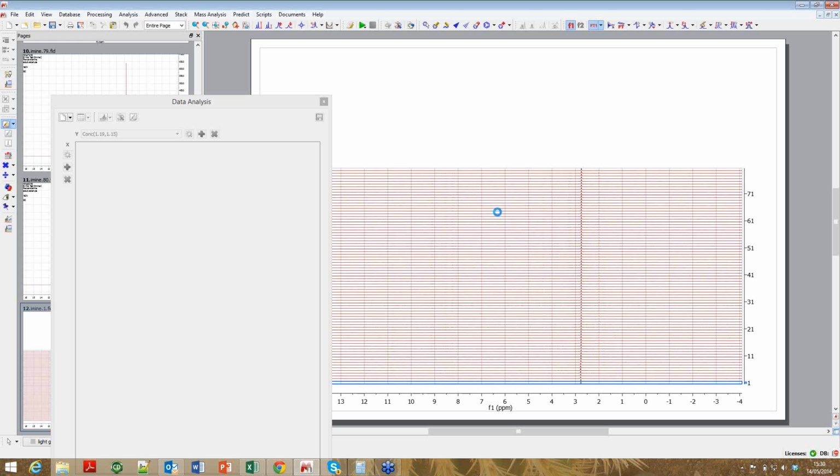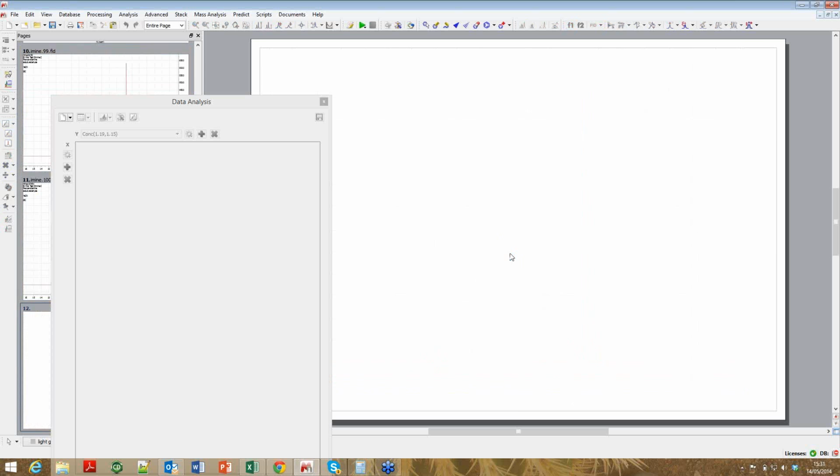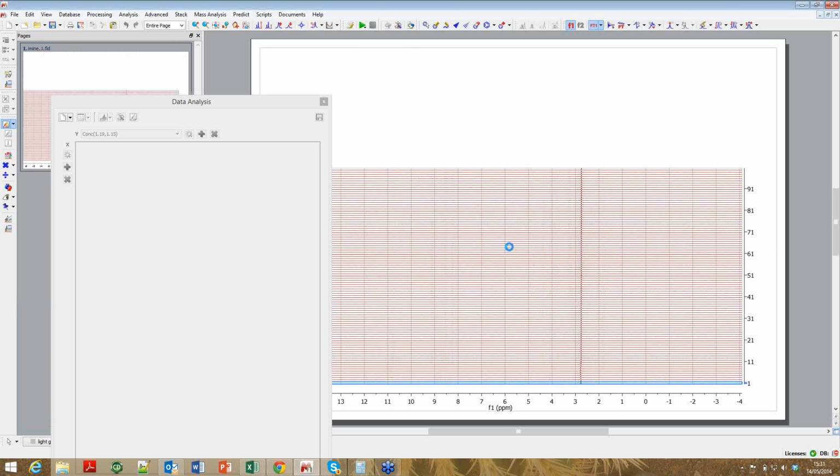Just to make a point: when you're doing these reactions on organic matrices or organic type reactions, and you do have the luxury of time, it's not uncommon to collect large data sets, perhaps with a couple of hundred elements to them. So this one with about 100 in it is not unreasonable at all. I think the enzyme kinetics ones tend to be a bit smaller because they're generally done at lower concentration.